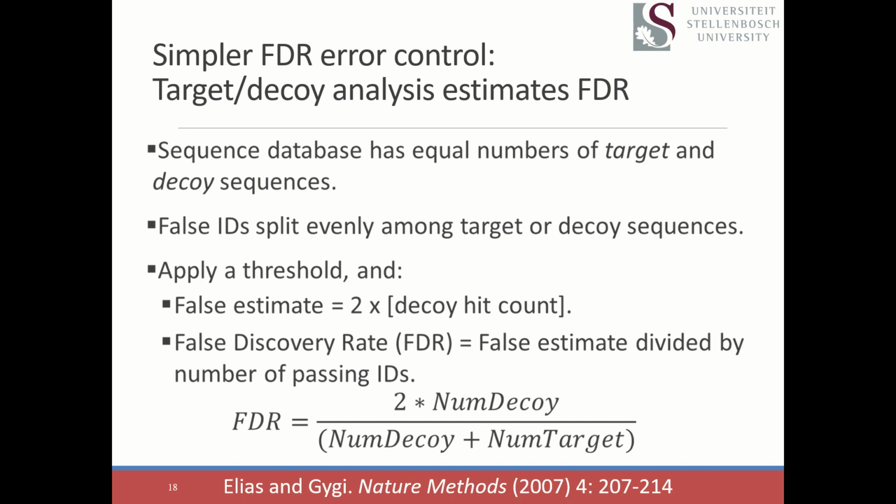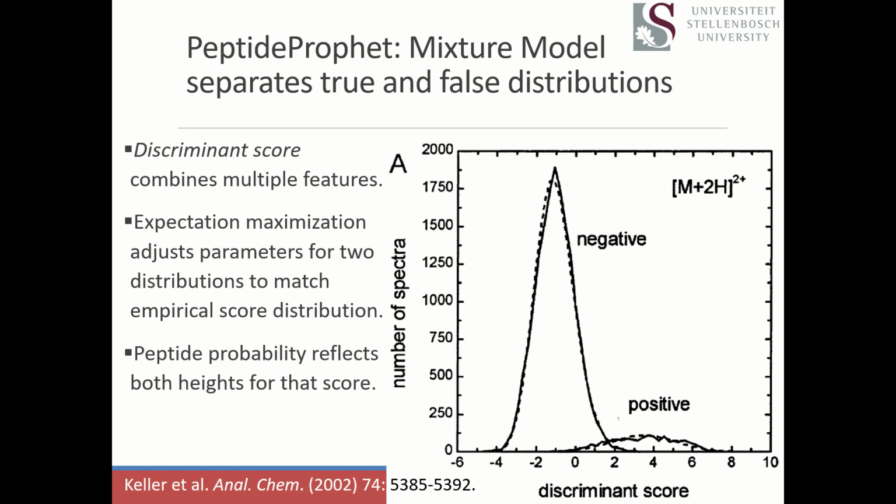What's the software doing? Yes, so you can imagine that PeptideProphet could simply assert that this distribution is two distributions summed together and try to fit them to it. But it's a whole lot easier if it's able to pin down where this negative distribution is based on the information in the search.